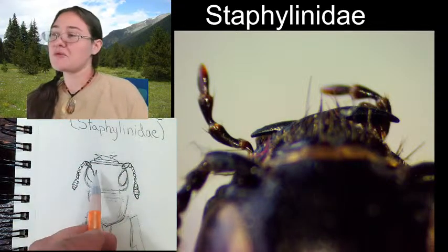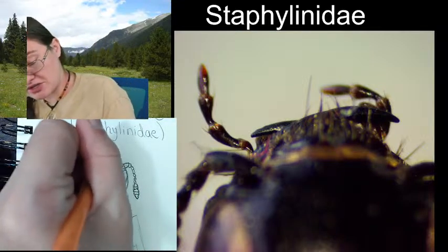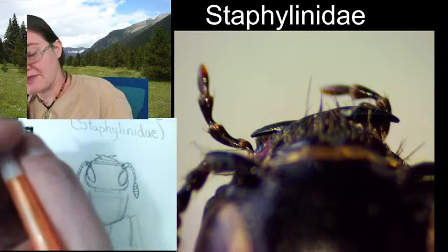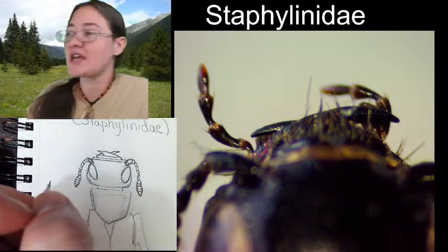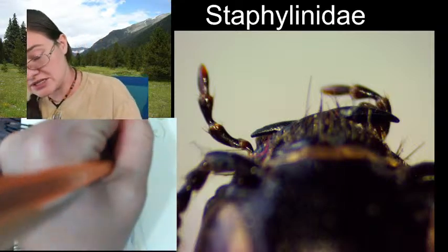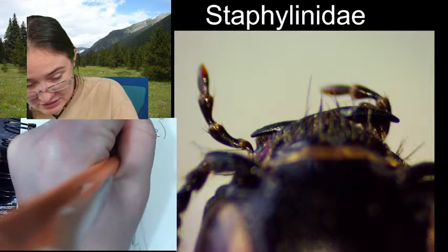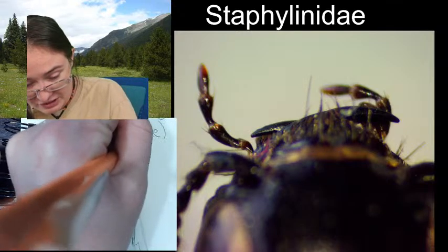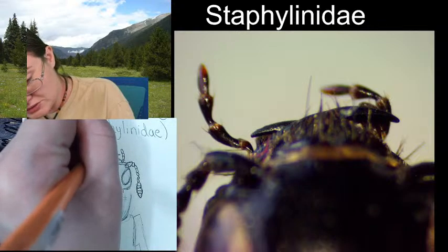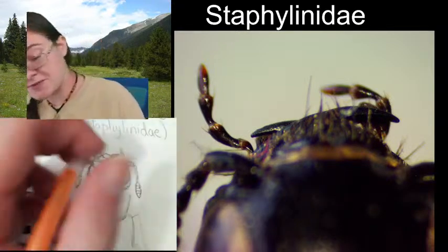Alright, the mandibles don't point out as much, so I wanted to make sure that they were pretty even and pretty low to the mouth part. And then the other thing we need to get in here and sketched are those labial palps. It looks like they are about 4 segmented, so we're going to go in and go 1, 2, 3, 4 on one side, and 1, 2, 3, 4 on the other side. So we've got those labial palps taken care of.